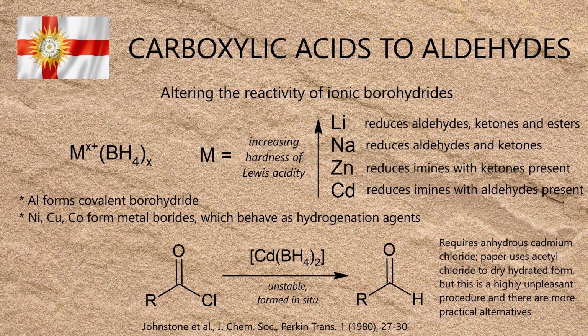I did actually dehydrate cadmium chloride using the method stated in the paper, refluxing in acetyl chloride, but that was a genuinely horrible job, involving a ton of hydrochloric acid fumes, so I've no desire ever to do it again, and I'll not be demonstrating it here. There are several other ways to make anhydrous cadmium chloride, and I intend to demonstrate a useful one in a future video.